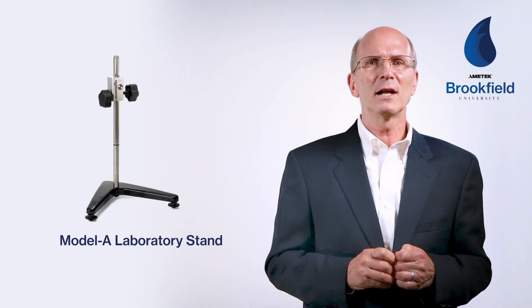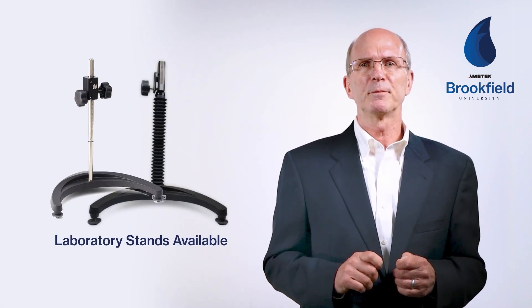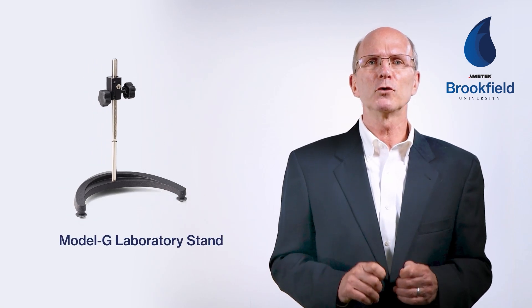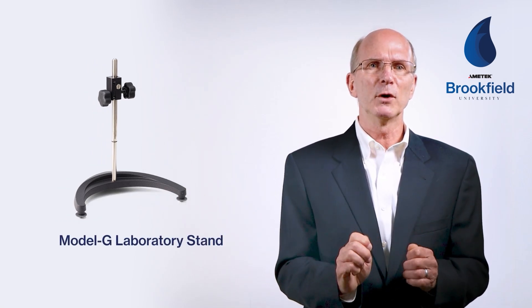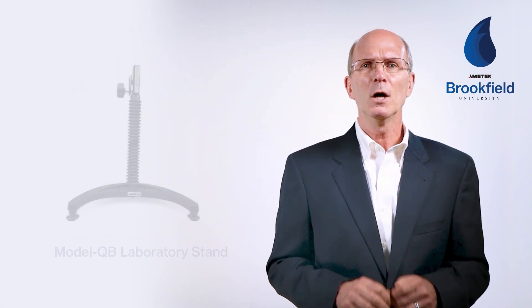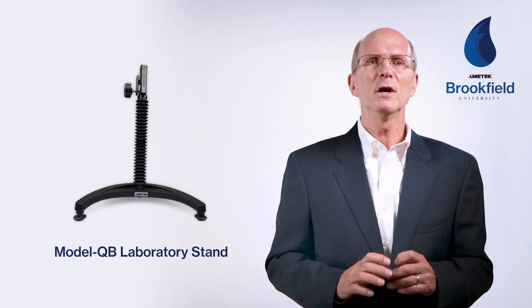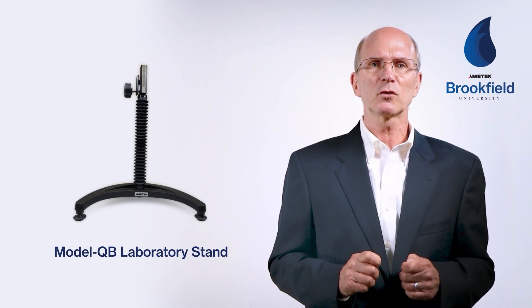Laboratory stands have evolved throughout the years with newer model instruments. The Model A was used for all dial and DVE viscometers until recently. The Model S was used for DV1 and DV2 instruments. Today only two lab stands are offered with all models: either the Model G or the Model QB. I recommend the Model G for use with standard spindles because its height adjustment knob allows for very precise placement of the immersion mark in the sample. The Model QB is great for all accessories, allowing for quick up and down movement for installing or removing the accessory or sample.